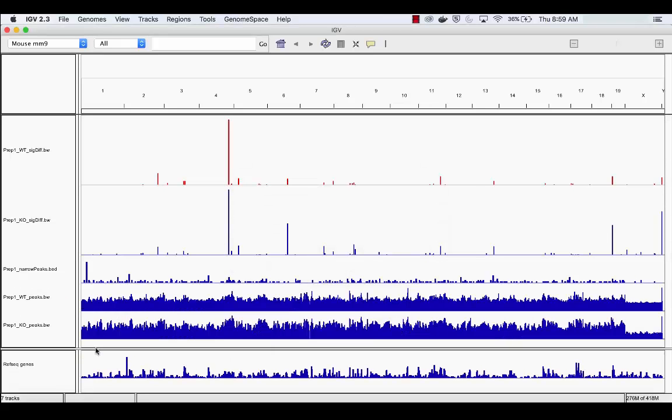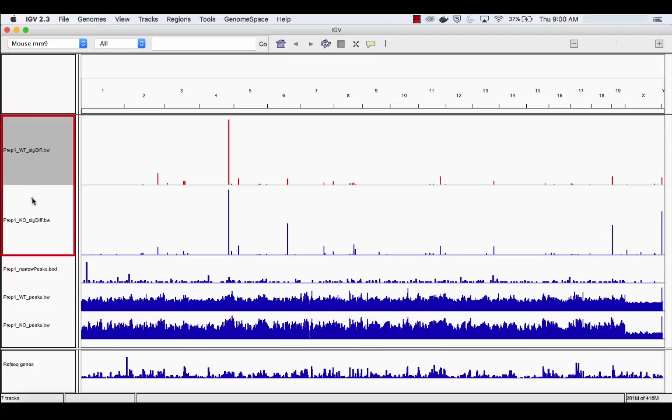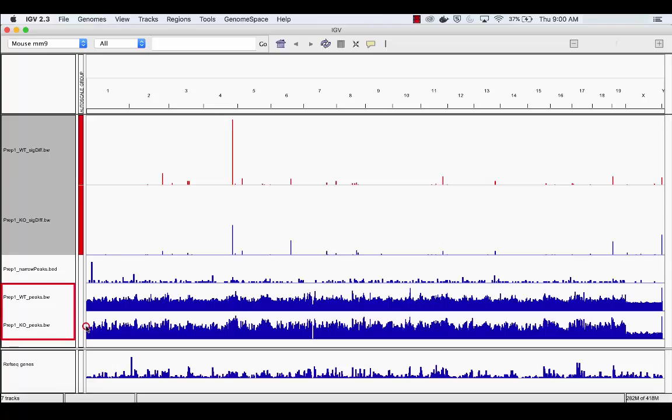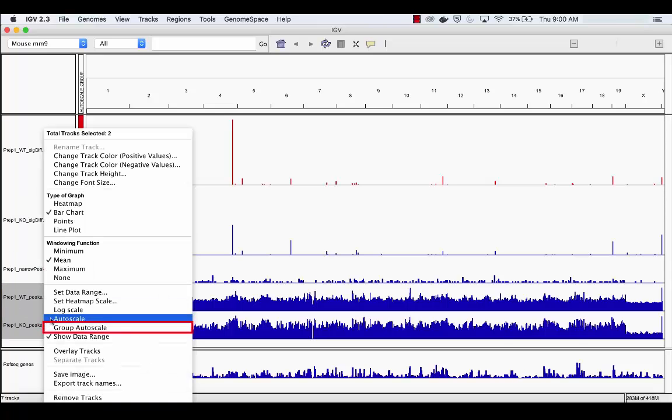Next, we will want to auto-scale all peak files and gene expression files to better interpret this data. Do this by highlighting each track and right-clicking. Then, select Group Autoscale.